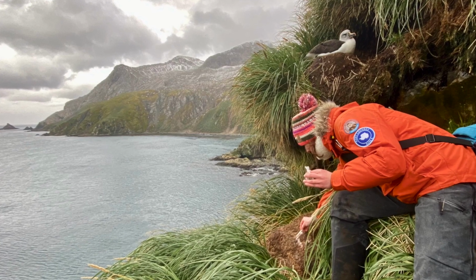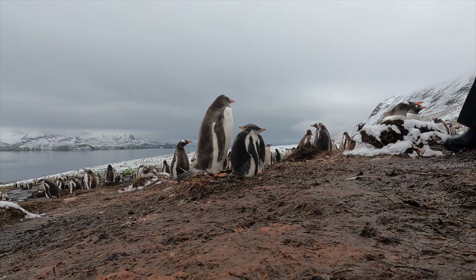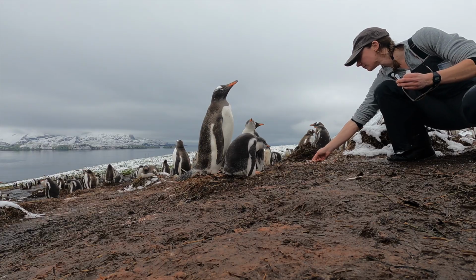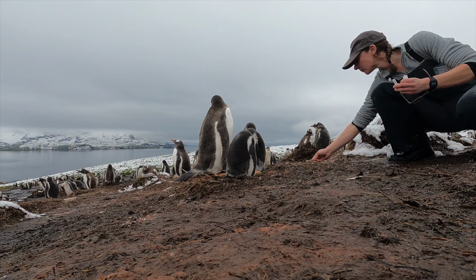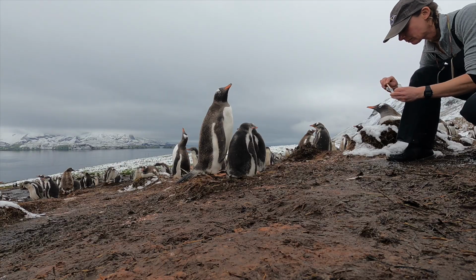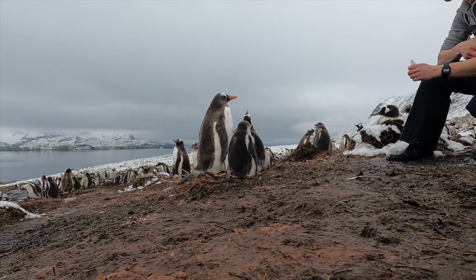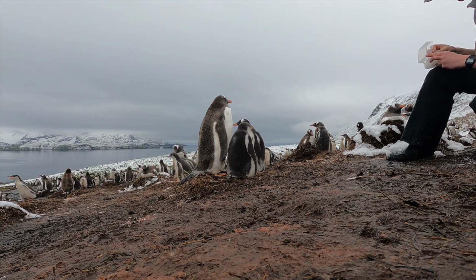Now, it is also possible to collect samples directly from the ground, but we have to be very mindful that if we're doing this, it's going to be very easy to pick up contamination from the ground itself. So you just want to collect the top surface of the fecal sample in this case. I'm really going to emphasize the importance of collecting field blanks when you're out in the field. Whether you're collecting from the ground, from plastic, or from paper, you want to collect some negative controls from those surfaces to monitor for any contamination that you might be picking up in the background.